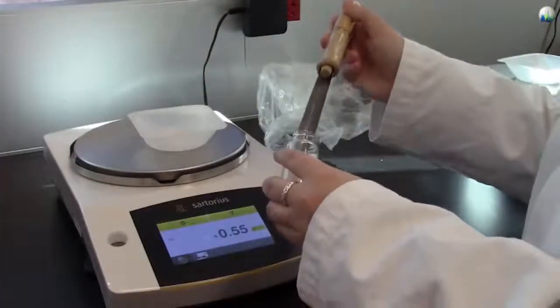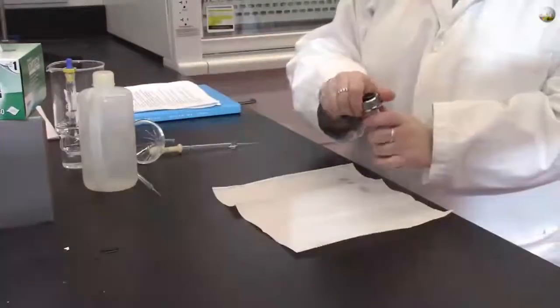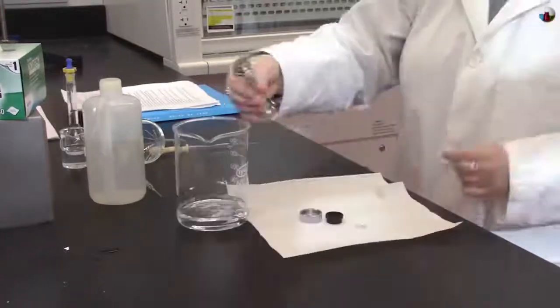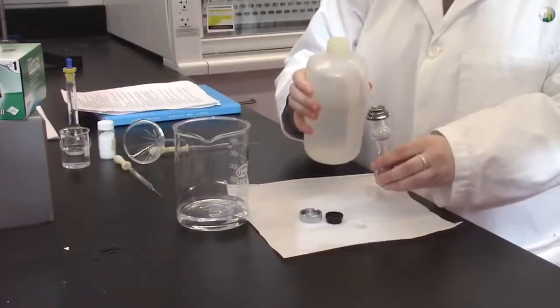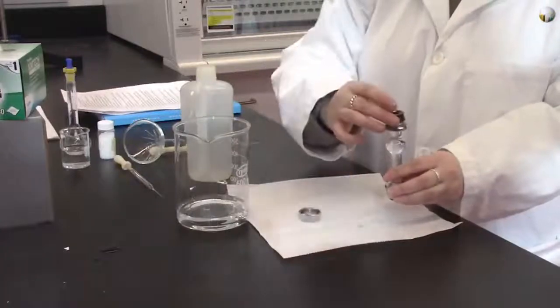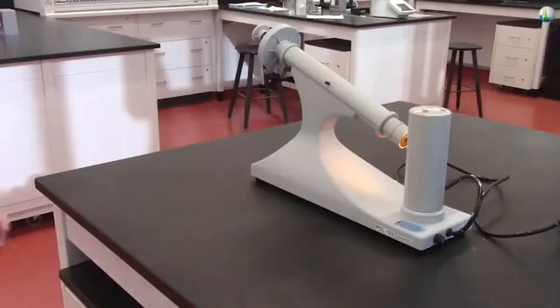Prepare the solution of the substance whose optical activity is to be determined. Next, clean the polarimeter sample holder with deionized water. Next, we must calibrate the polarimeter with deionized water. To do this, fill the sample holder up to the top with deionized water and ensure that there are no bubbles.